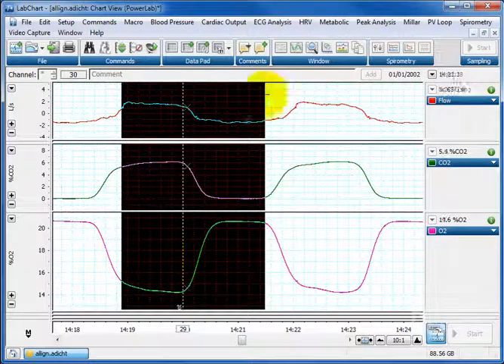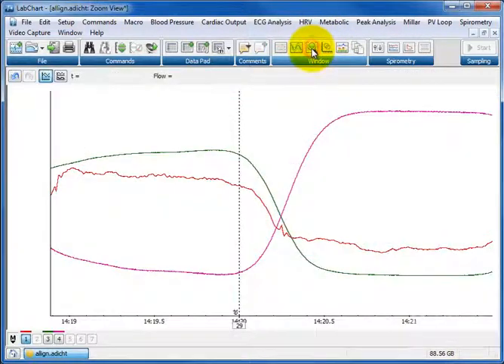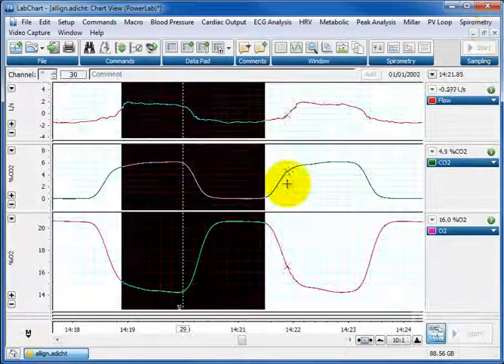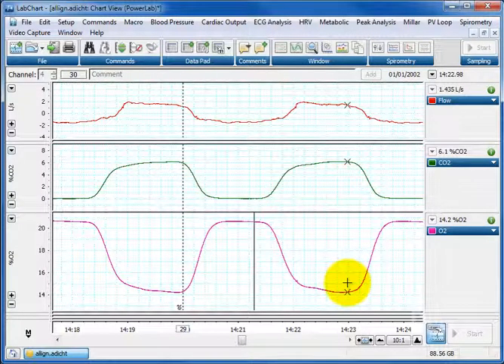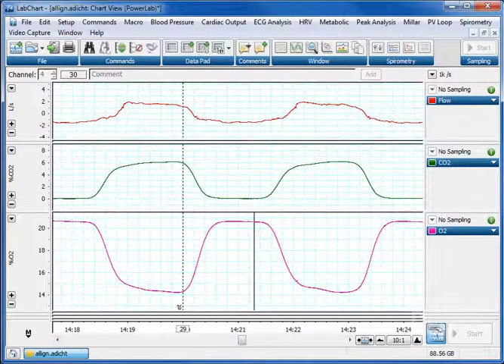In line now with the CO2. I click on this zoom view now and you can see now they're perfectly lined up, everything is exactly as you expect it to be, and now we can carry on our analysis knowing that our respiratory gases are nicely aligned. Okay, that's it.